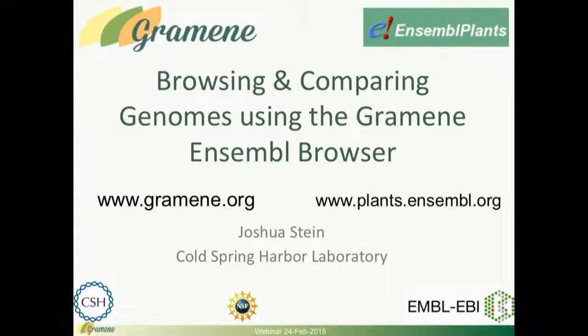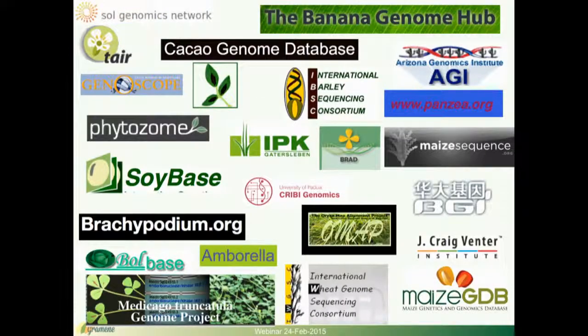So you can gain access to this resource both from www.gramene.org as well as plants.ensembl.org, and you'll pretty much be viewing the same resource. Before I go on, I want to thank all of the community databases. They are the ones that are really contributing the data that enables our resource, and they're the ones that are producing the science here.